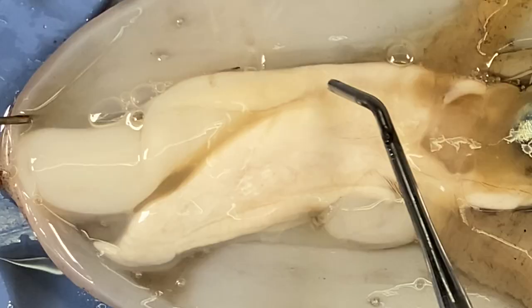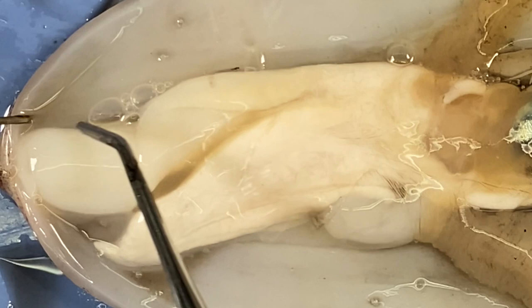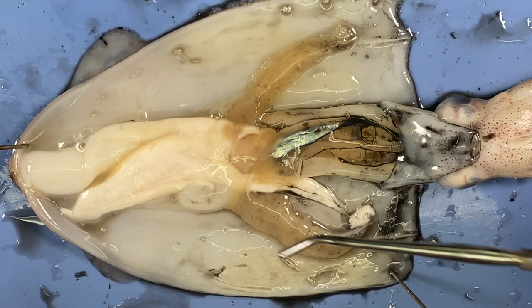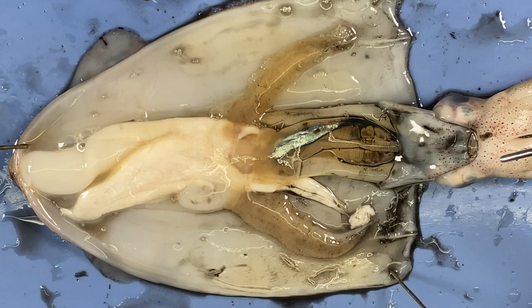Now let's look at the digestive system. Most of this is involved in digestion, though each squid is a little different inside and it's sometimes hard to tell. In order to differentiate the digestive part from the other parts, I'm actually going to shoot some dye into its mouth. It will go down its mouth along its esophagus, hopefully into the stomach, and then we'll see where the dye goes to differentiate digestive from the rest. I'm going to use a red dye and a pipette — this is very hit and miss whether it works.